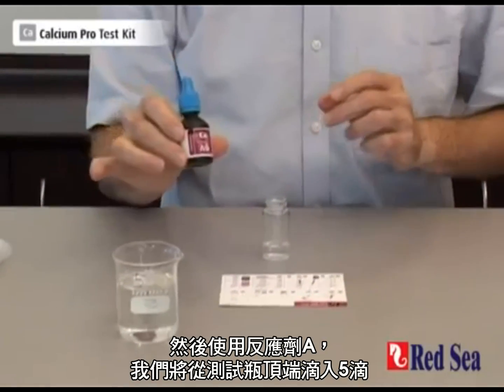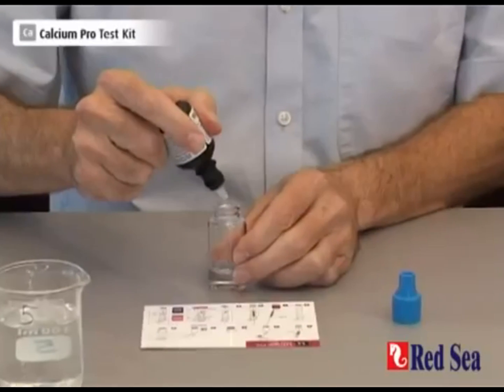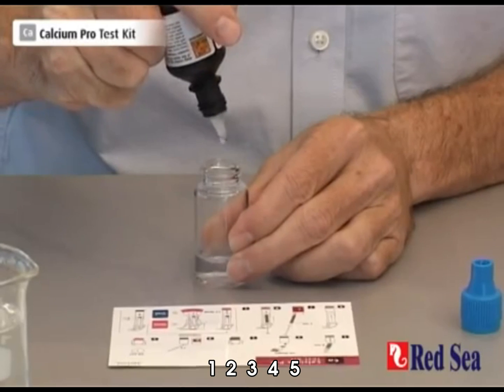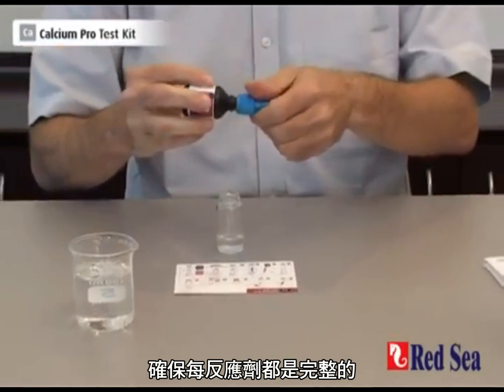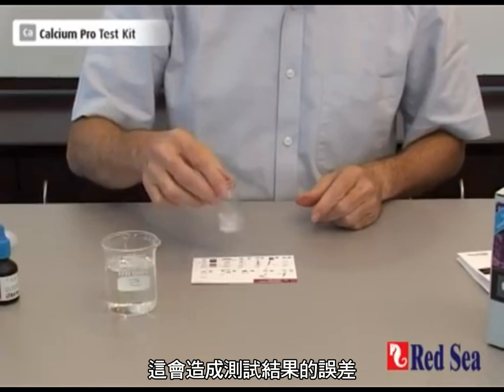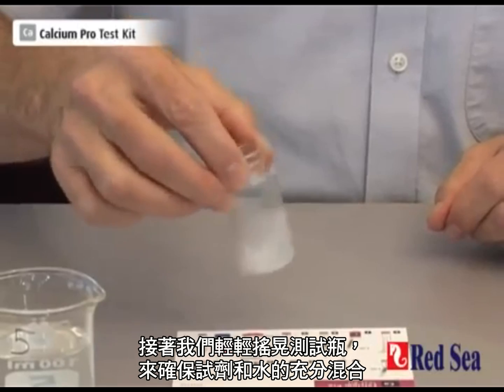Then we take reagent A and we're going to drop 5 drops into the top of the vial. It's important to make sure that they are full drops, because sometimes you get more of a bubble burst than a drop, and that will cause an error in the test. Then we shake gently for a few moments just to make sure that the reagent is mixed well with the water.